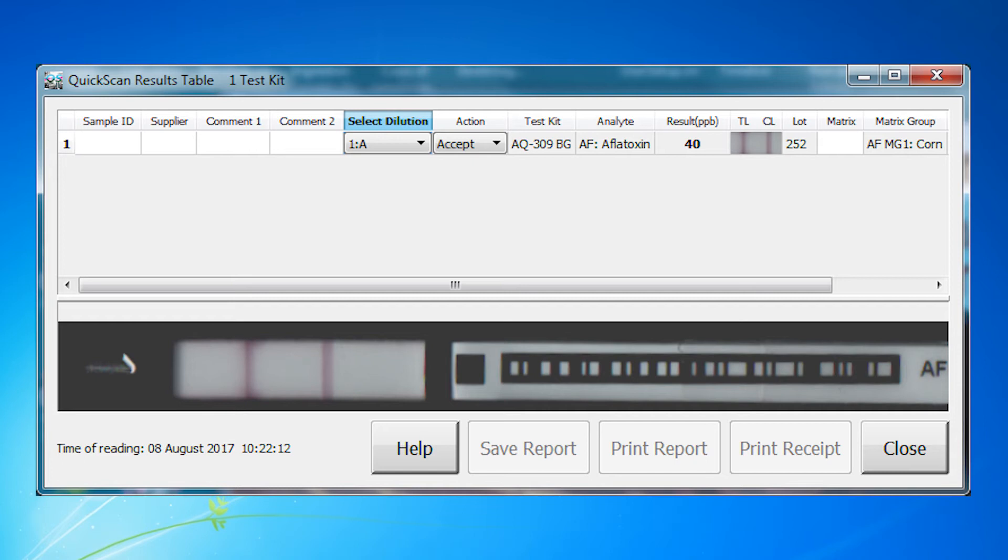If your sample results from the dilution A testing are greater than 100 parts per billion and you desire additional quantitation, you may run the dilution B protocol.